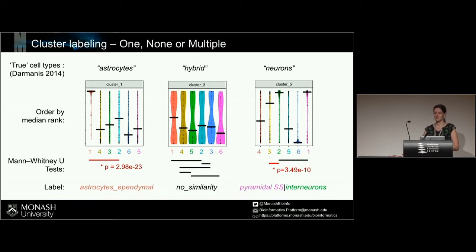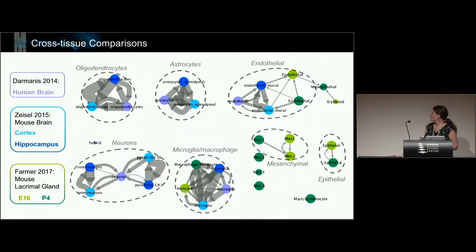And there's also a few other heuristic information that we apply to these labels as well. We check it's above random, and also report any reciprocal hits. I won't go into that now, but it's there. Okay, so I want to do some wider testing to make sure we're not just going to label everything in sight with everything else in sight.